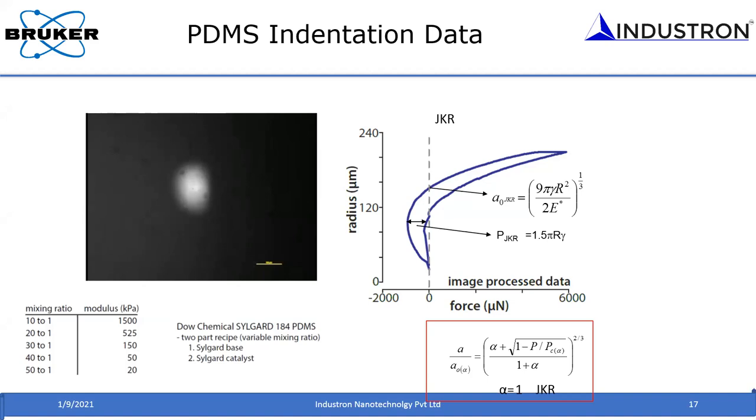So now, for example, if you have a gel, if you wanted to understand the property of the gel, you can measure directly with this technique. Or if you have a gel capsule or something, you can apply the stress and see how the capsule is deforming or exploding and releasing the material inside, and you can directly correlate that, okay?